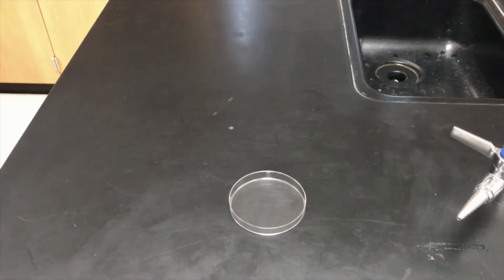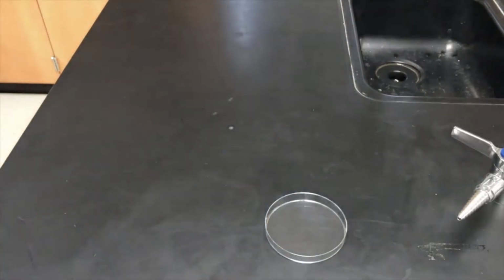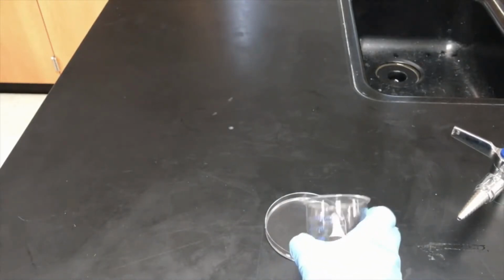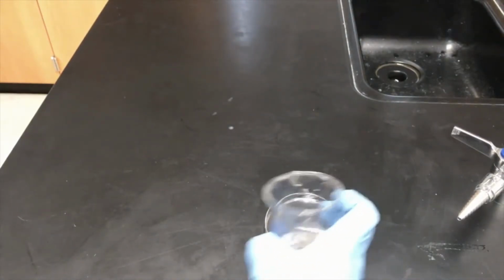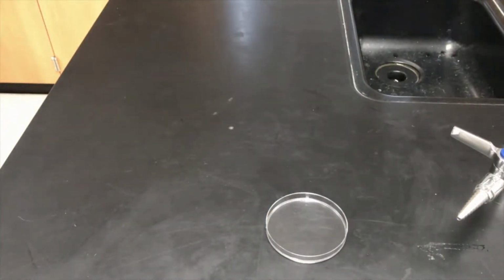So in this video, I'm going to show you the first example of an electrolysis reaction. So the first thing I'm going to do is take my Petri dish and pour some distilled water in it. Okay. Make sure it's totally full. Okay. And then I'm going to add just a little bit of sodium sulfate into it.